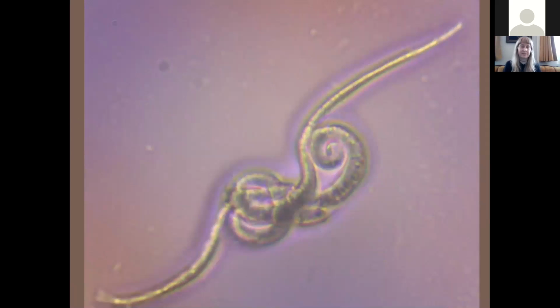And here's an example of something unexpected that I found under the microscope. This is a nematode, so just like a little worm-like thing that happened to be floating around in the mushroom flesh. And I mean, how many of these things have you eaten when you're cooking up mushrooms for the first time? Probably a lot. There's a lot of wildlife happening in wild mushrooms, but they're microscopic, so you're cooking them. It's extra protein. But they're beautiful and they're doing stuff in there.